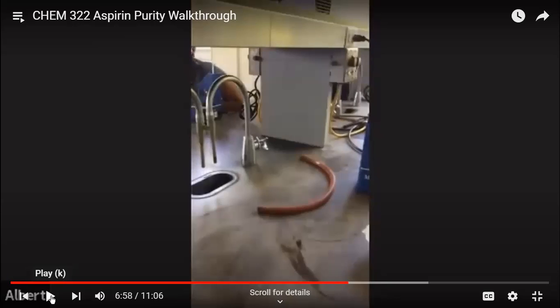Normally when you do the melting point, you need something to compare your pure sample to, and that's the crude. So we'll take some crude aspirin, take the melting point of that, and then take the pure aspirin, take the melting point of that, and compare them. On the data sheet, there's space for you to list 2 trials, but we're only going to list 1. The first will be the crude, and then samples 1, 2, and 3 and their pure melting points. Each one of you will measure your pure sample against the crude.